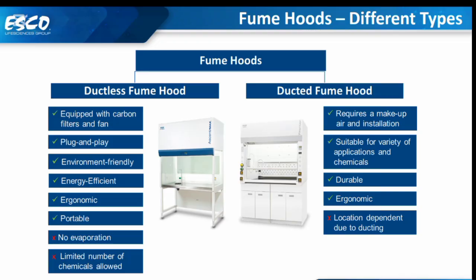Durable, ergonomic. The disadvantage is that it is location dependent due to the ducting. You can't really move it easily, because now you will have to remove all the ducting installation to move it from one point to another. And also the other disadvantage is that it doesn't protect the environment.